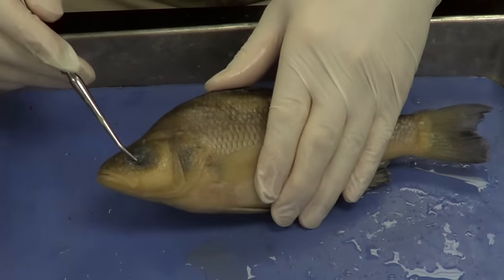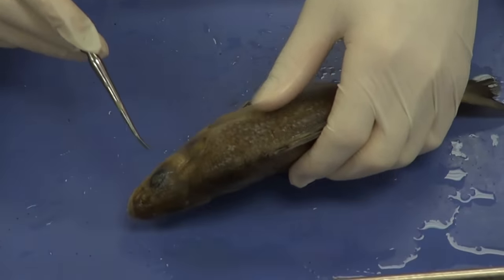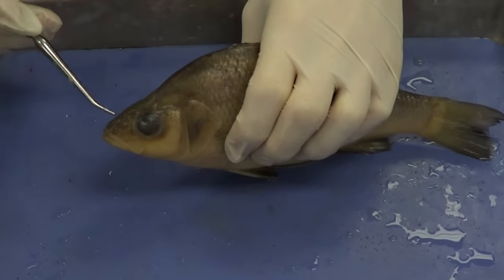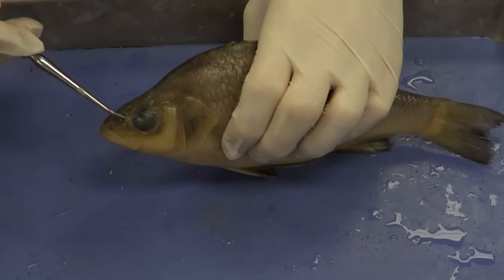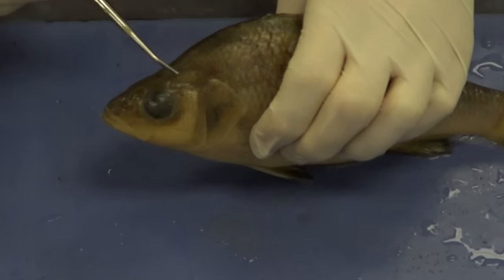You can easily see both eyes — here's one eye and we've got another on the other side. Between the eyes and just a little anterior, we have two openings here. These are the nostrils that allow the fish to actually smell.